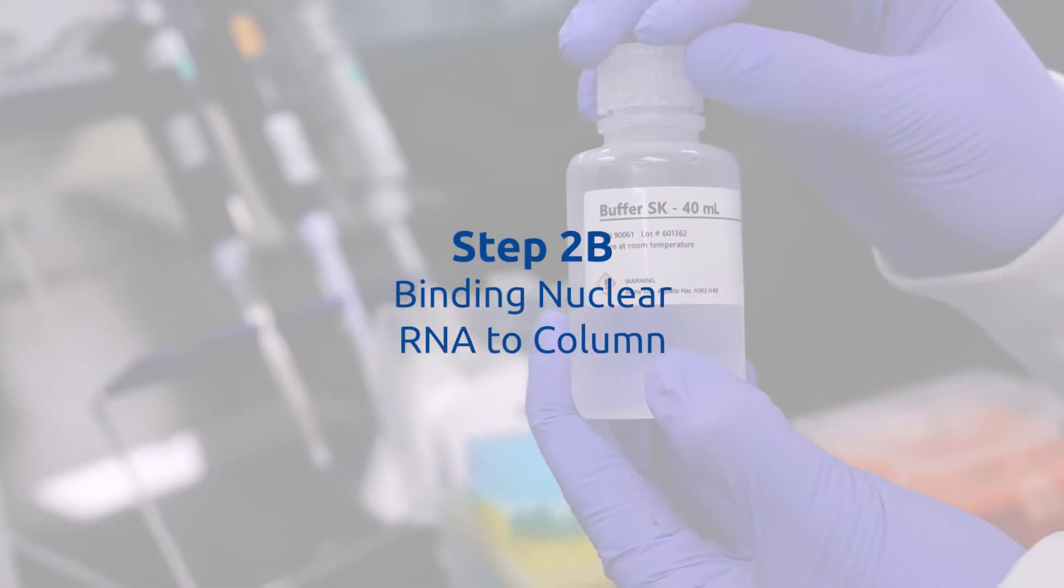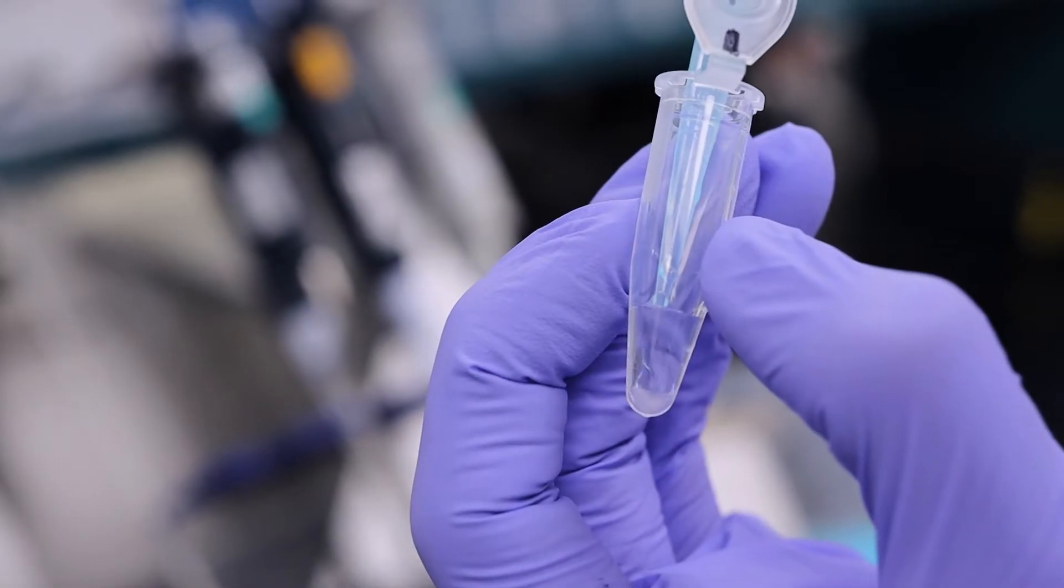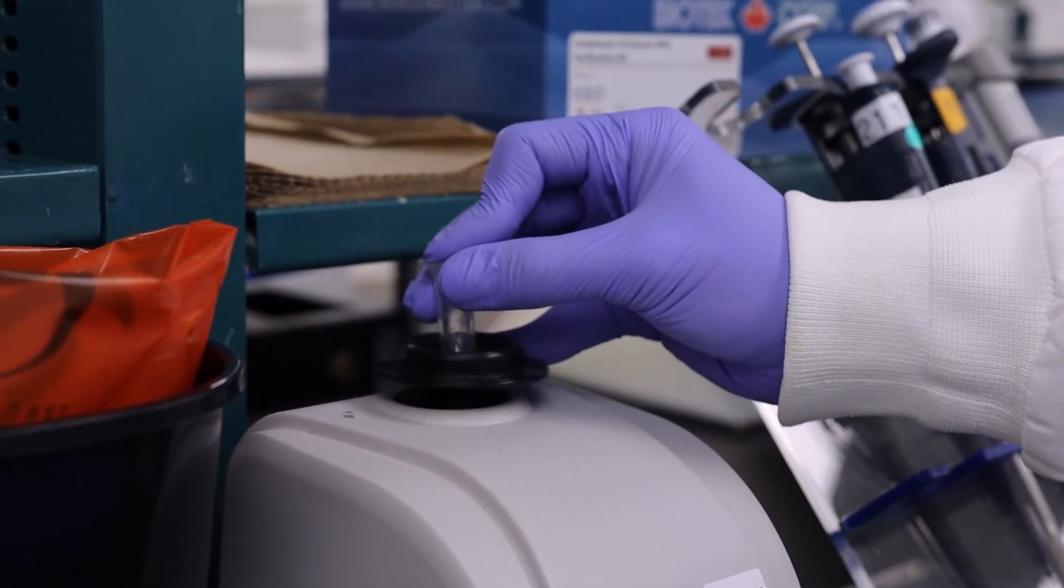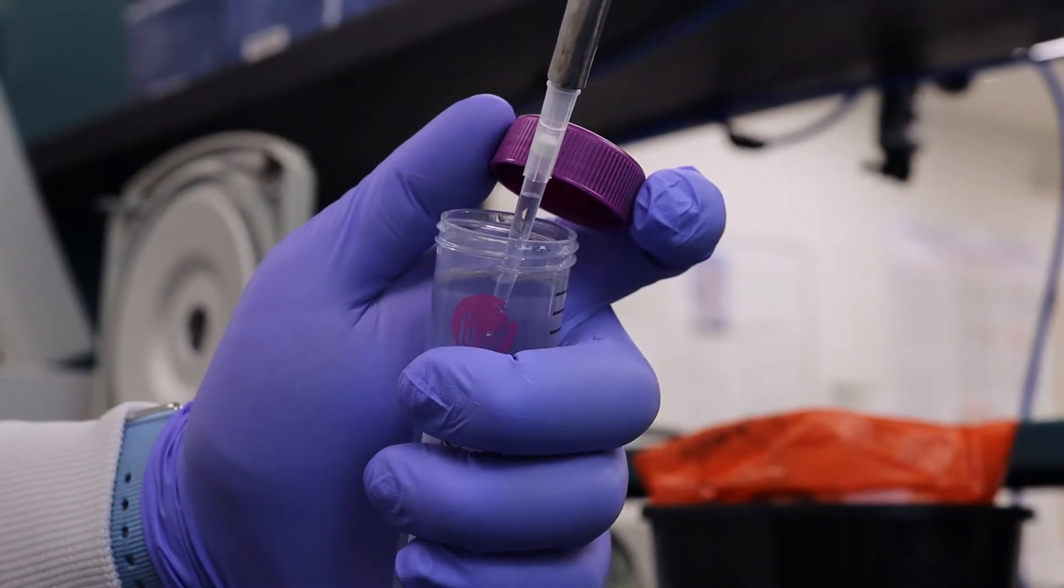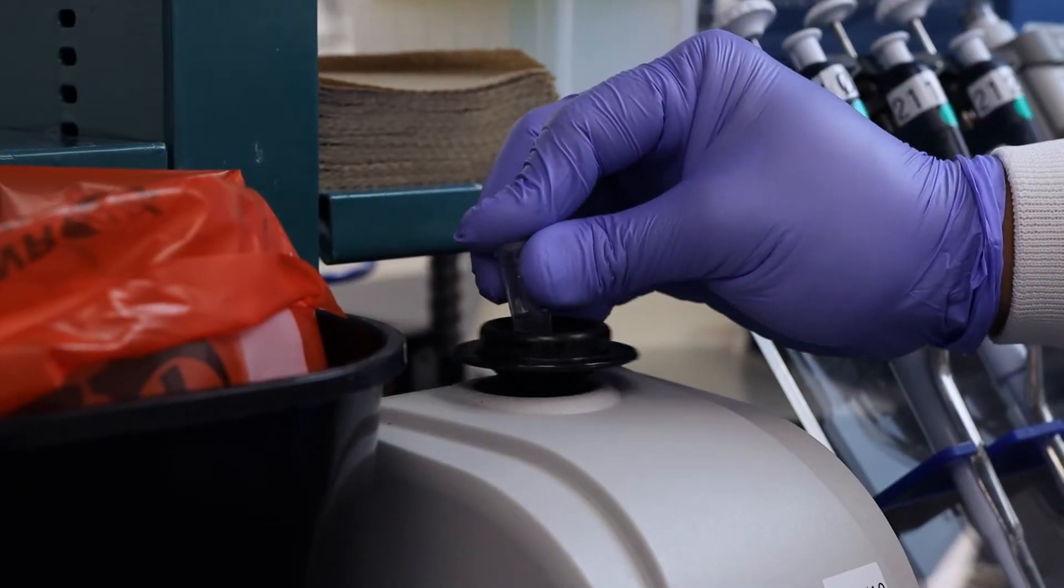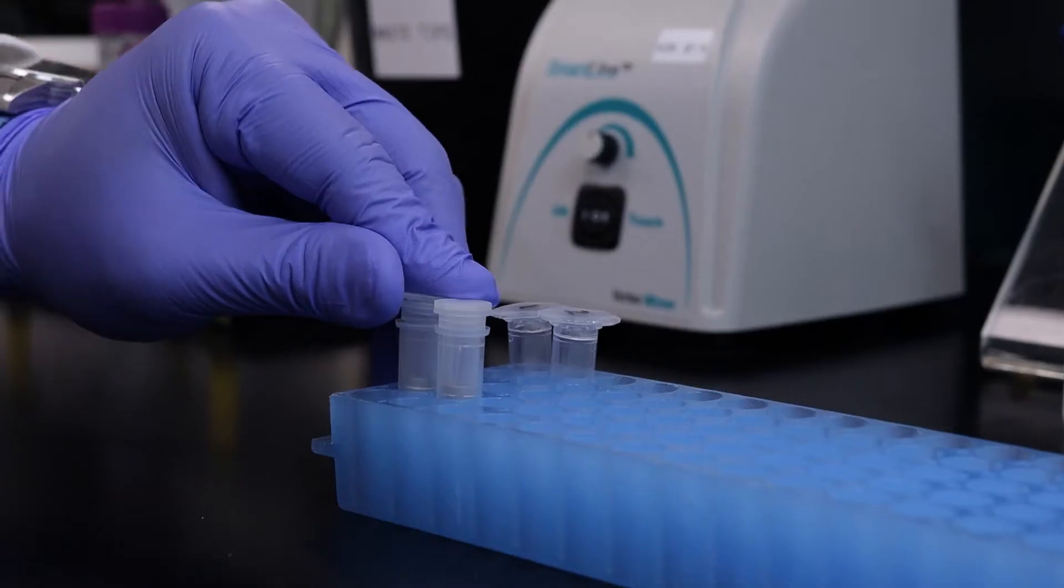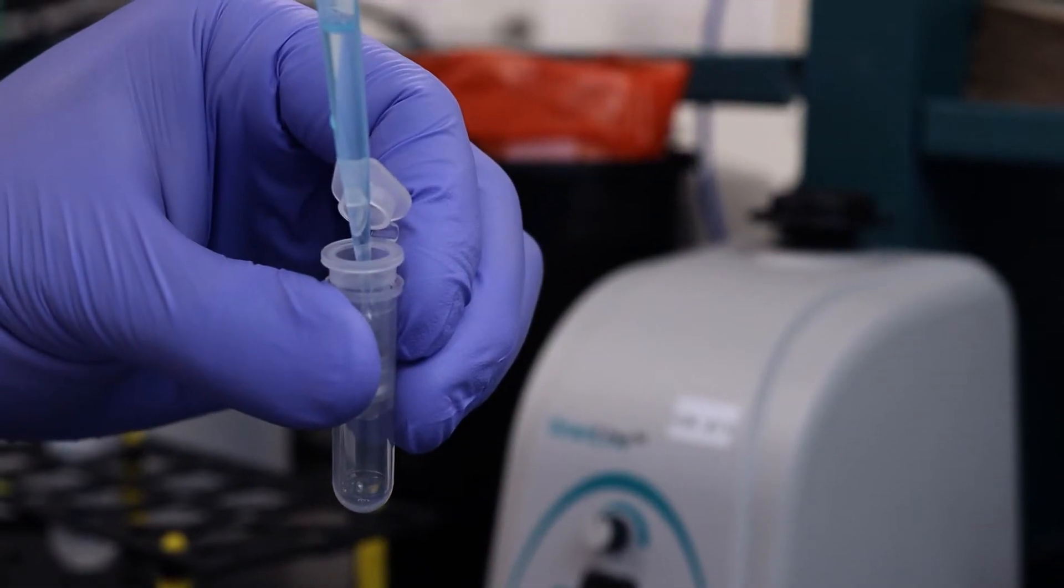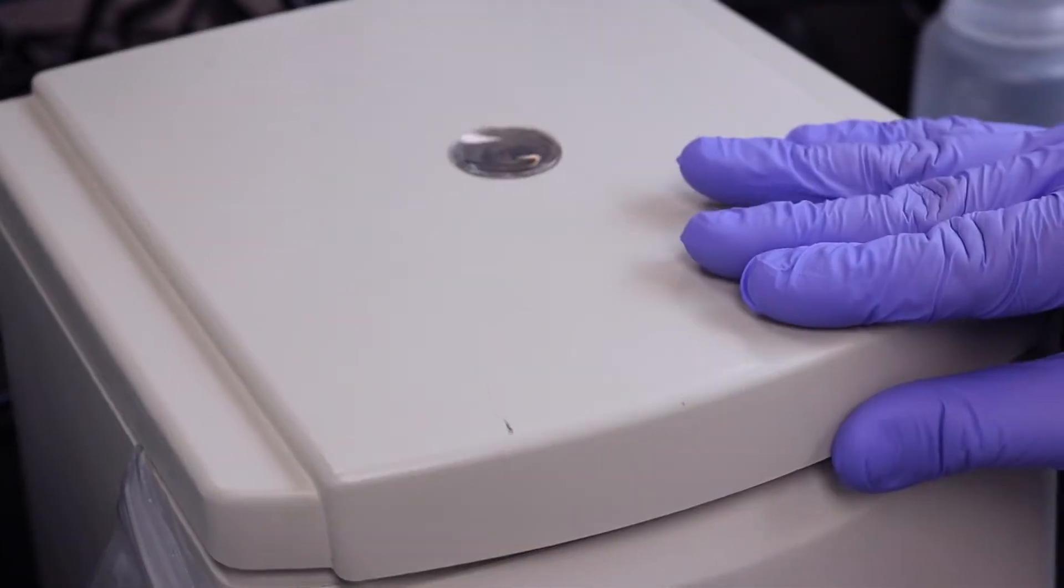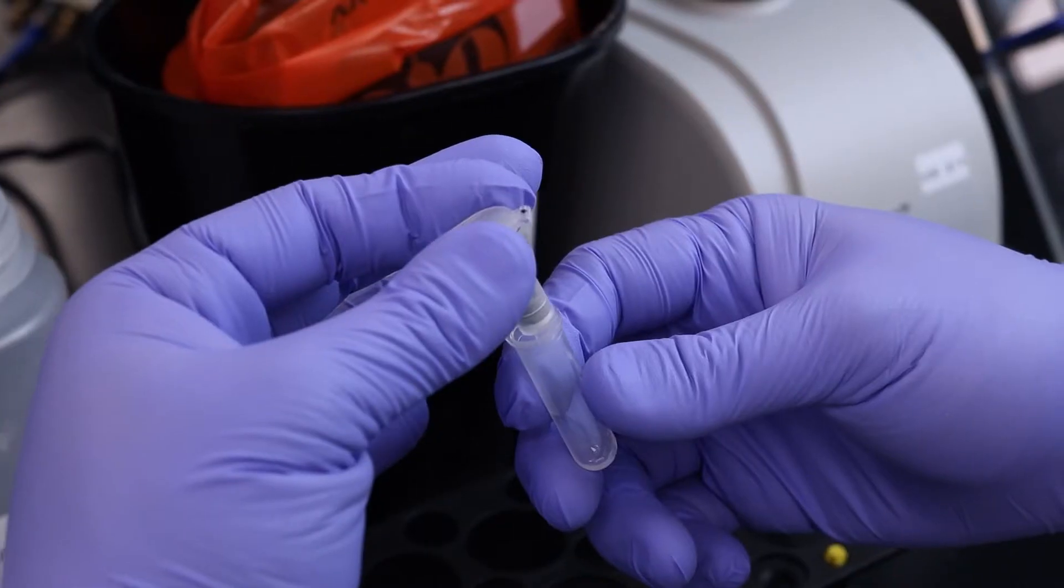Step 2b: Binding nuclear RNA to the column. Add 400 microliters of buffer SK to the pellet nuclear RNA fraction. Mix by vortexing for 10 seconds. Add 200 microliters of 96 to 100% ethanol to the mixture. Mix by vortexing for 10 seconds. Apply the mixture onto a spin column assembled with a collection tube. Centrifuge for 1 minute at 3500g or 6000rpm. Discard the flow-through and reassemble the spin column with its collection tube.